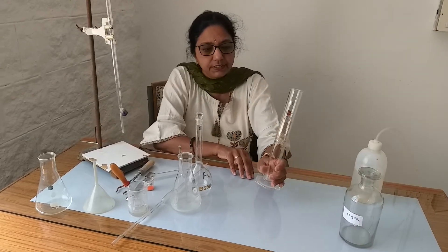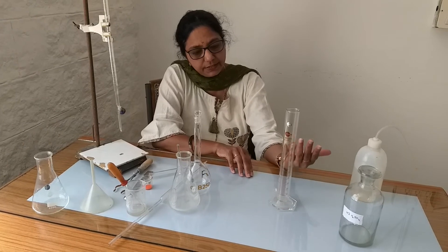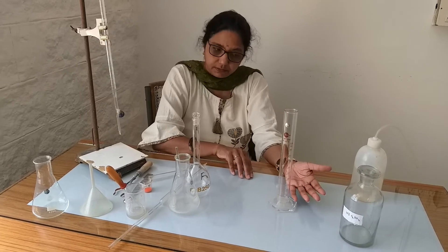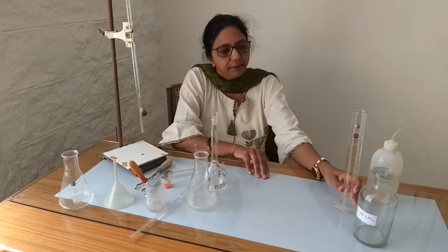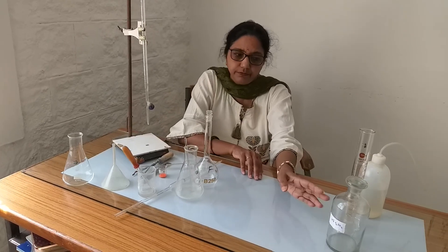This is the measuring cylinder — a graduated cylinder used for taking the solvent or solution in the required amount. We use these measuring cylinders, and they can be made of glass or plastic.